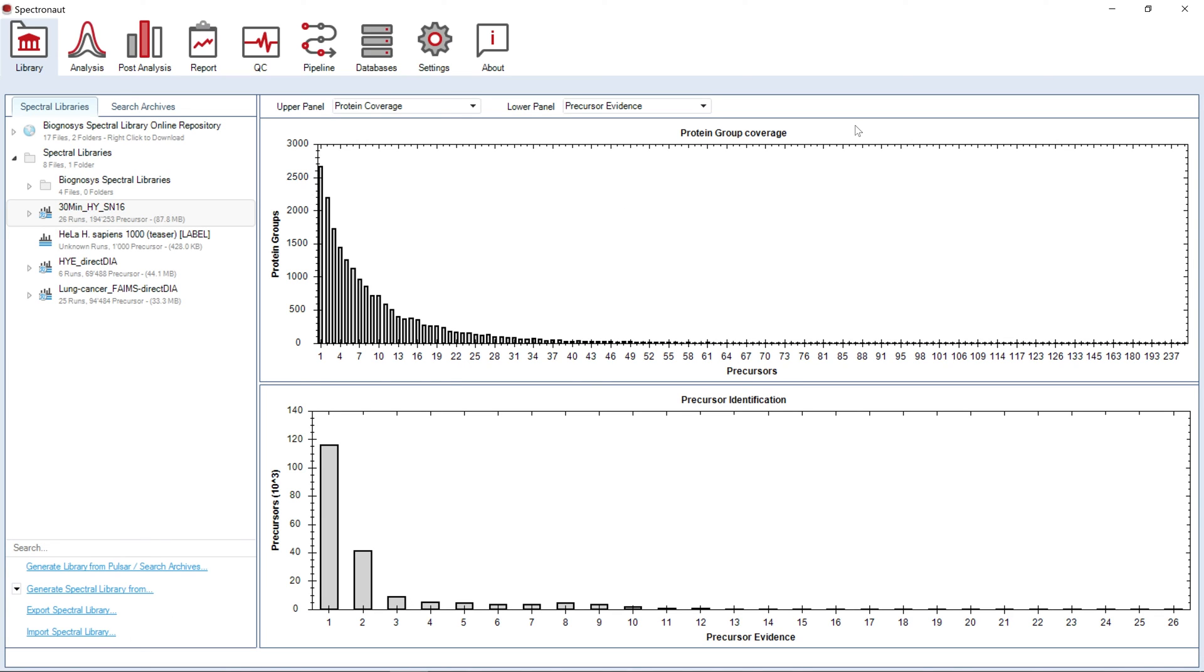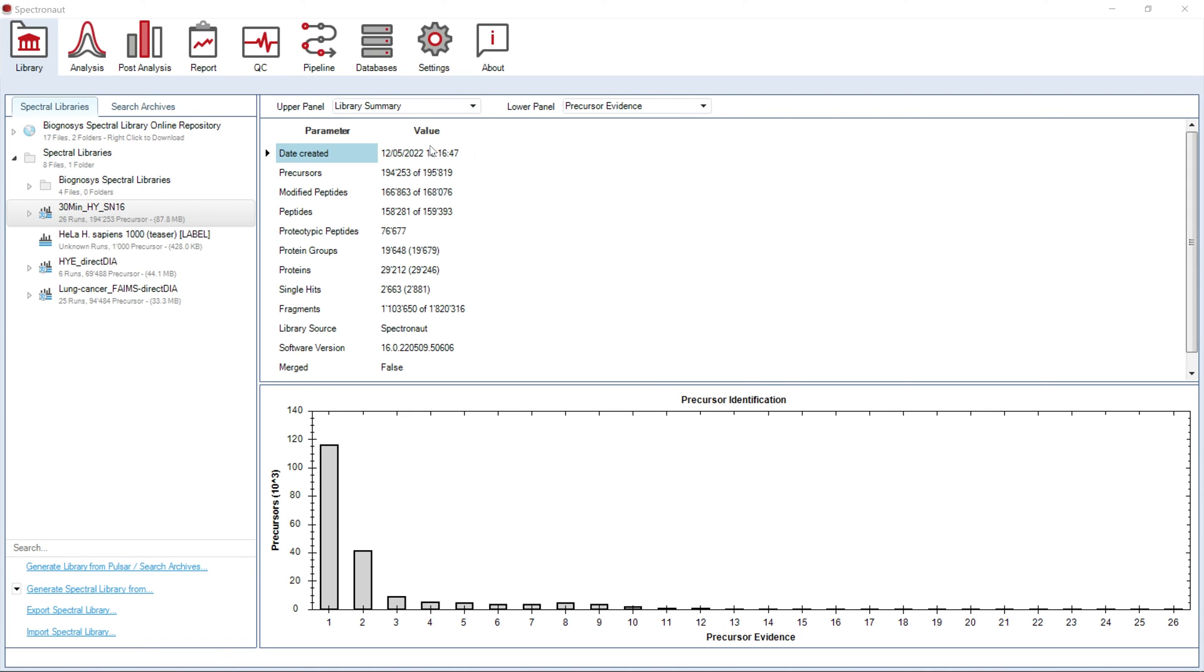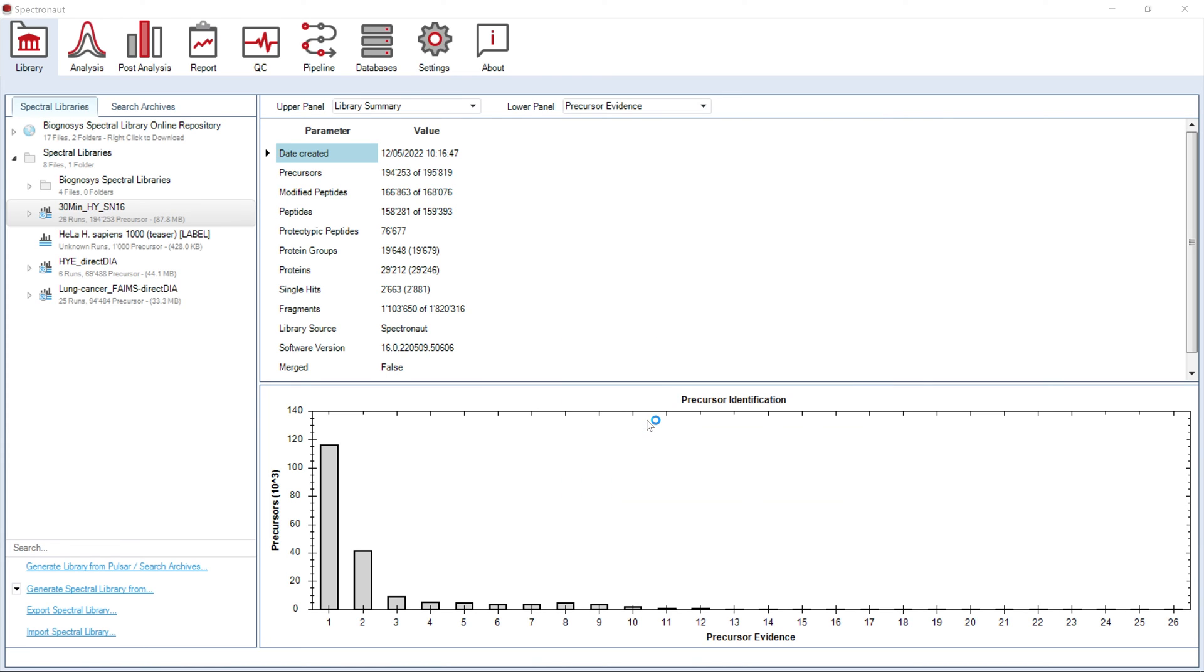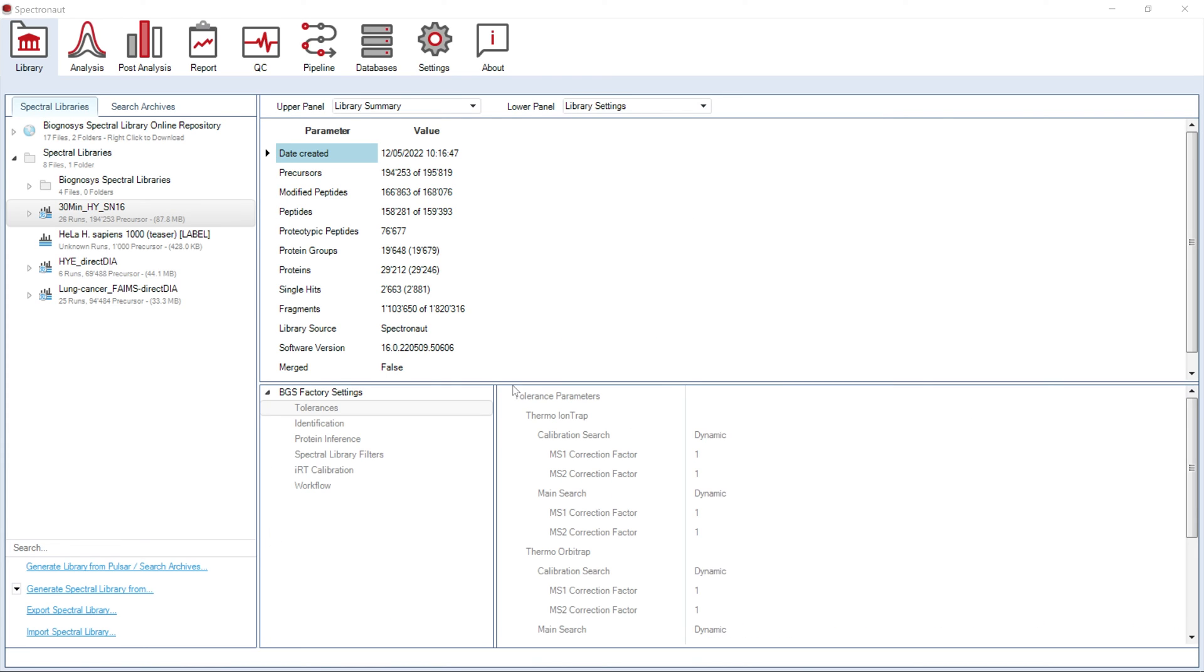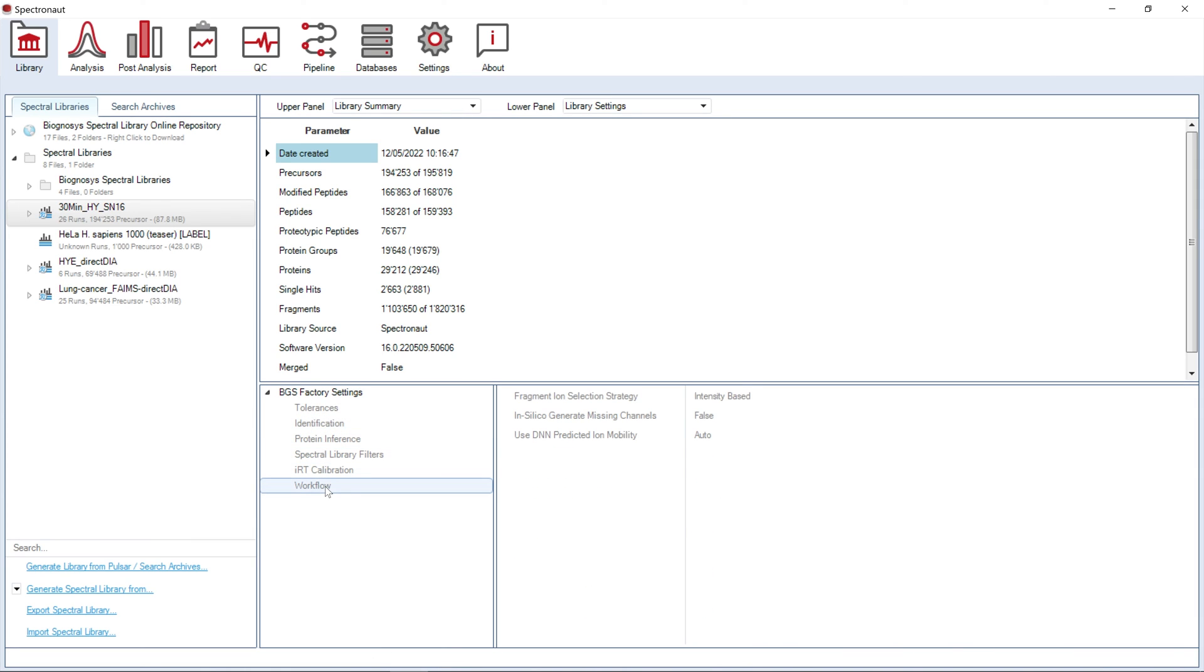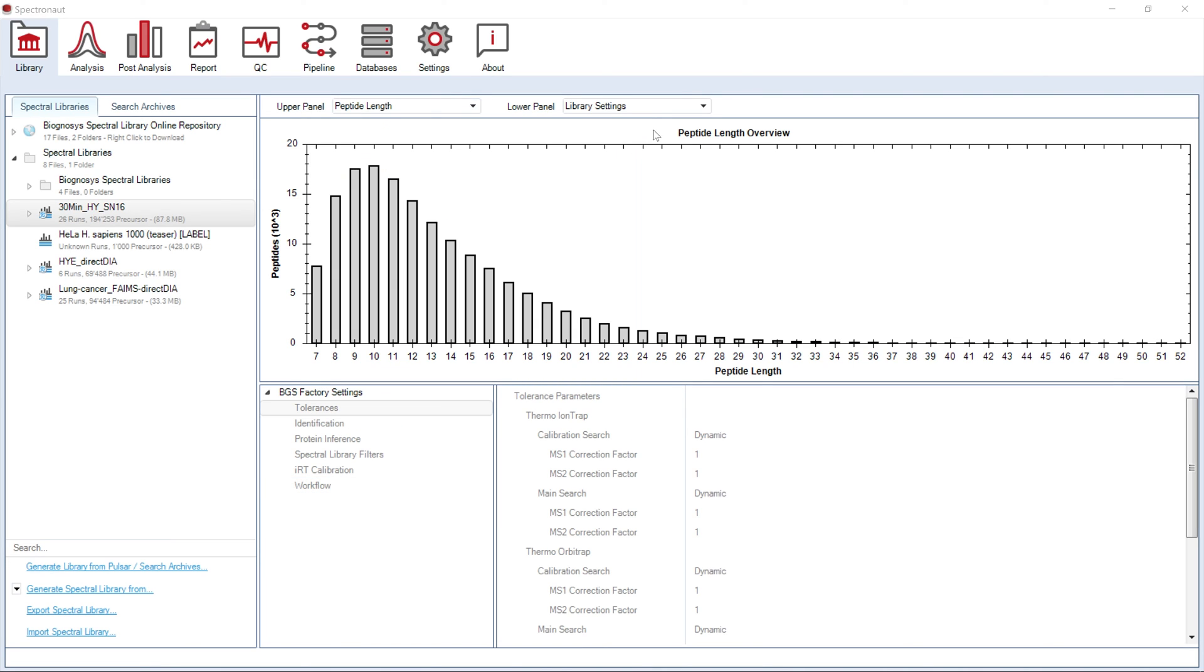Let's see what type of information we can read out for our library. First, the library summary will show the number of identifications at protein, peptide, and precursor levels. If you do not remember which library settings were selected for that particular library, you can select library settings preview.